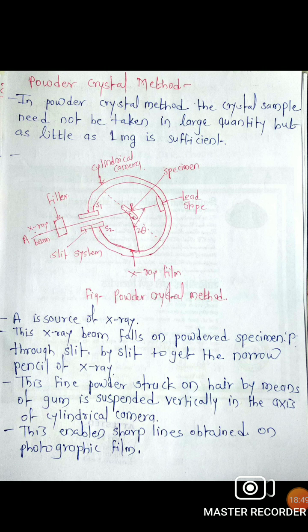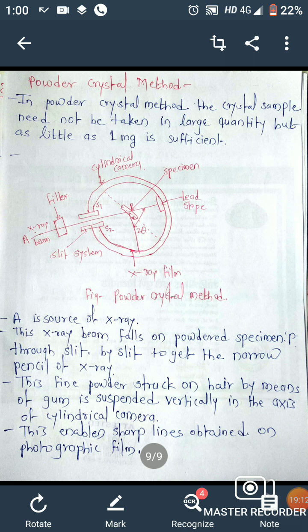powder crystal method. This powder crystal method is most useful for cubic crystals and for determining the complex structure of metals and alloys. However, their structure could not be revealed by earlier study. This method is also useful to make the distinction between the allotropic modifications of the same substance. Today we stop here. In the next lecture we will see the applications of the X-ray diffraction method.